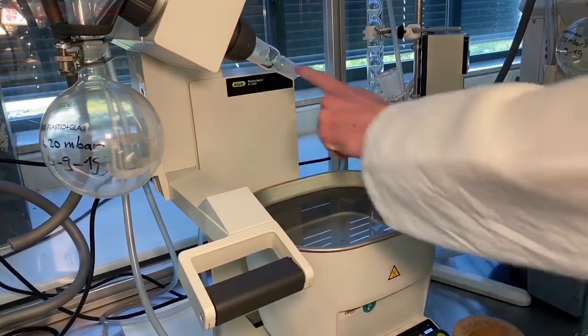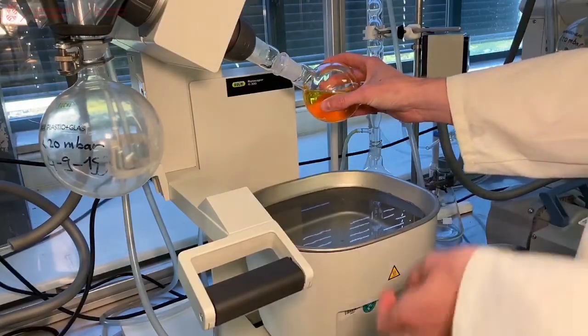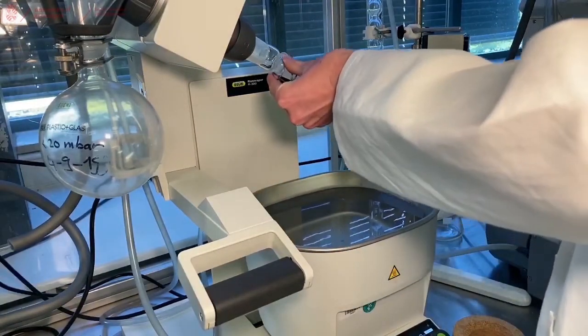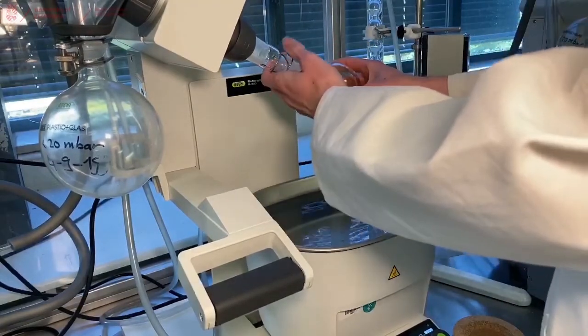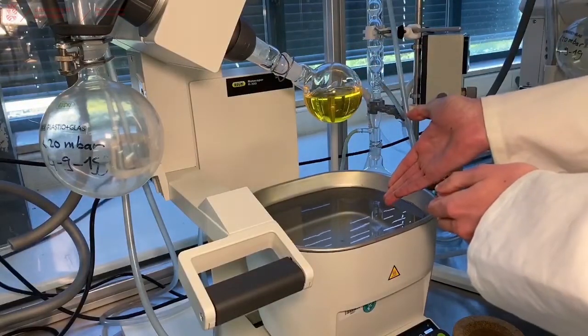If you have a smaller flask, you need to place another attachment here. Place it on the attachment and make sure to always place a clamp. This clamp will save you from collecting your product from the water bath.